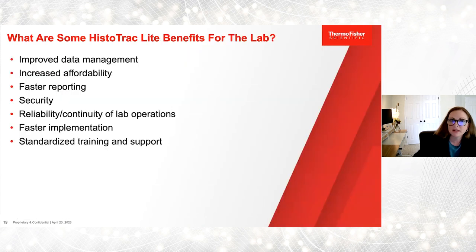So what could be some of the benefits for this? Again, even with a more out-of-the-box solution, you're still able to improve your data management. It's giving you increased affordability, faster reporting, faster implementation.